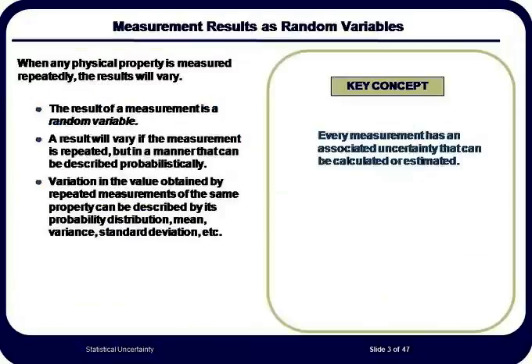Whenever any kind of measurement is made, there is uncertainty of the measurement with respect to what the true value is. Suppose that a measurement is repeated by the same person, by a different person, using a different instrument, or using a different part of the same sample. For each of these 4 different instances, you would likely get a slightly different result. That's because any time a measurement is repeated, even by the same person using the same instrument on the same material, the distribution of the final measured values will vary in a manner that can be described probabilistically.